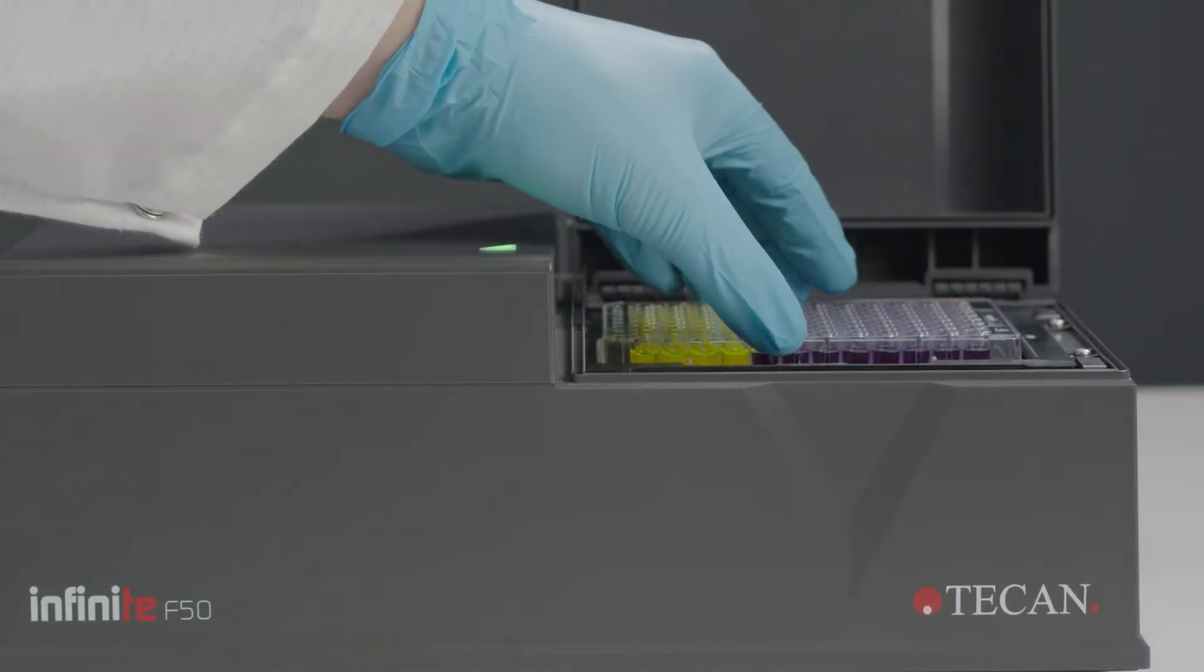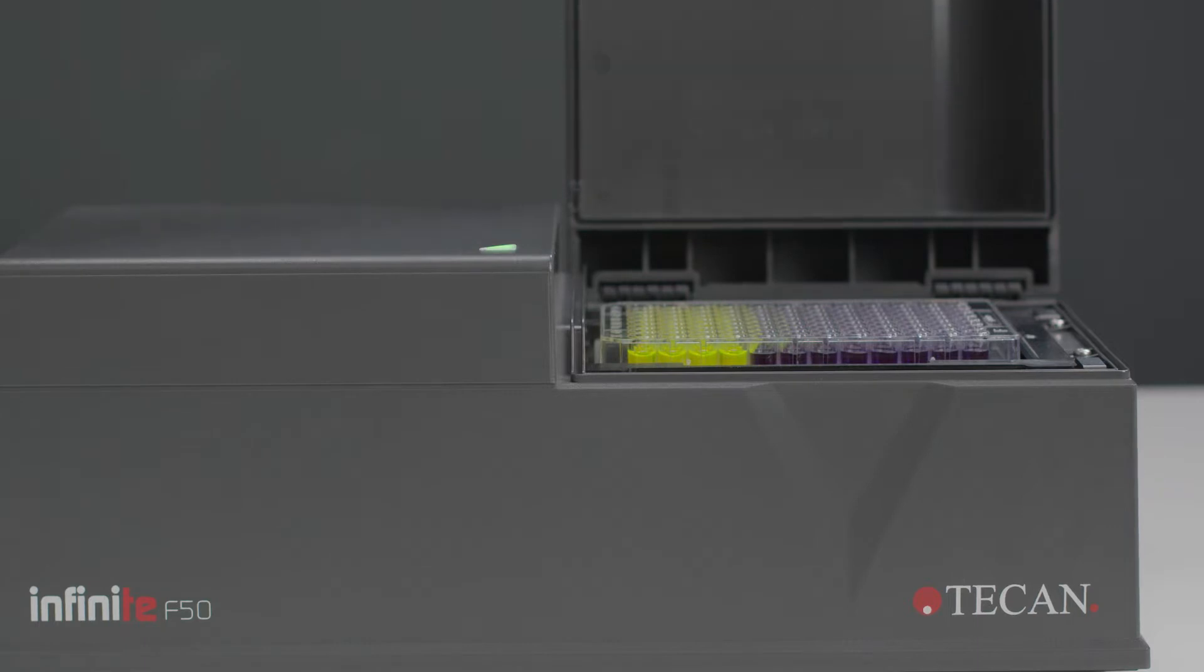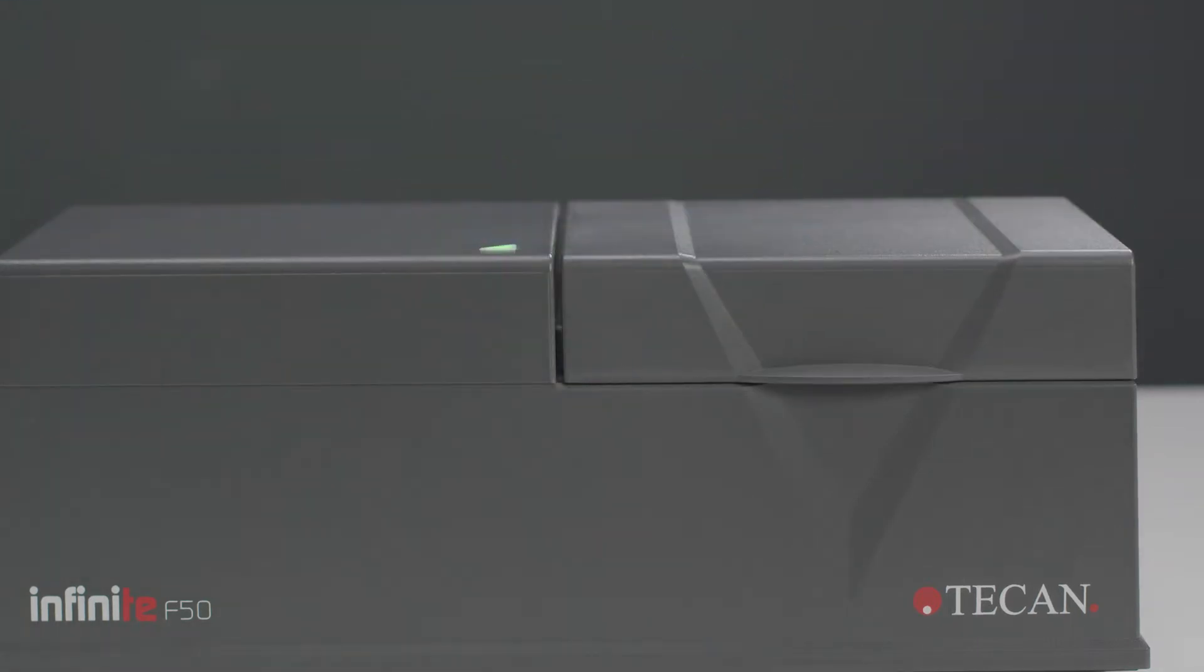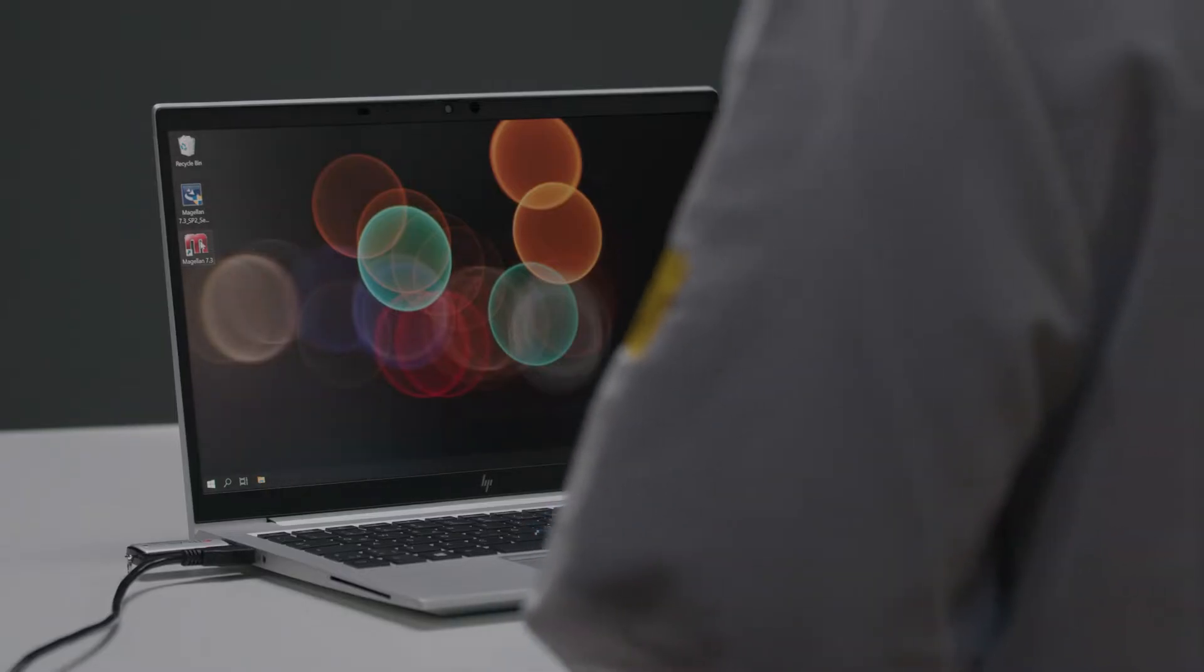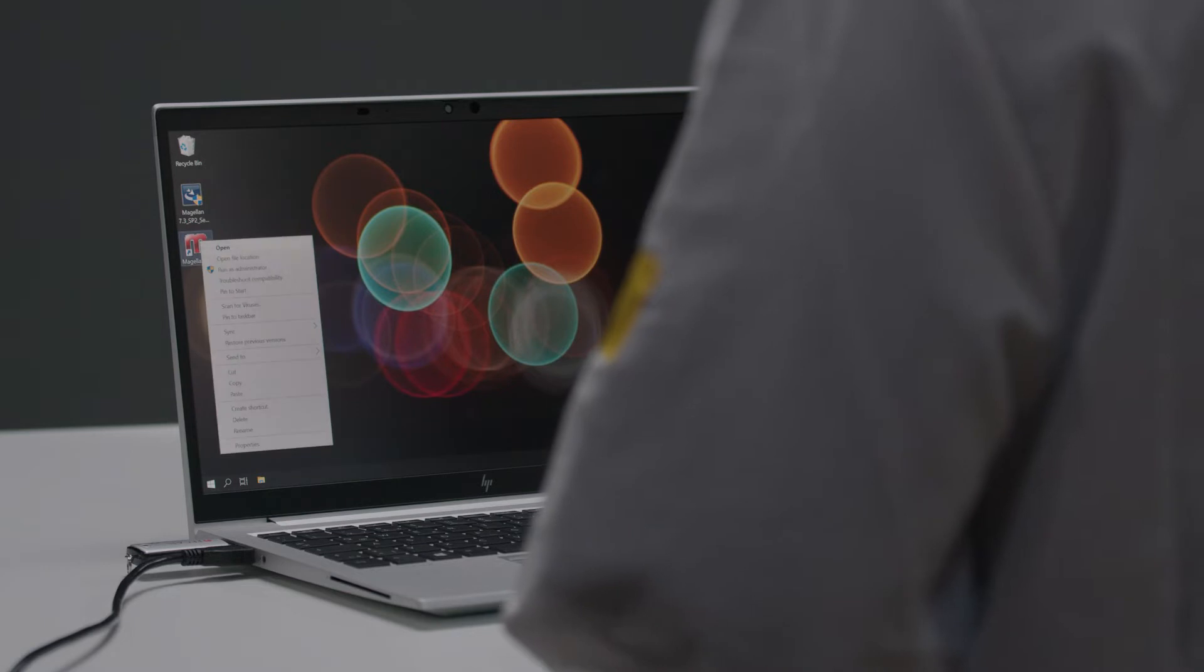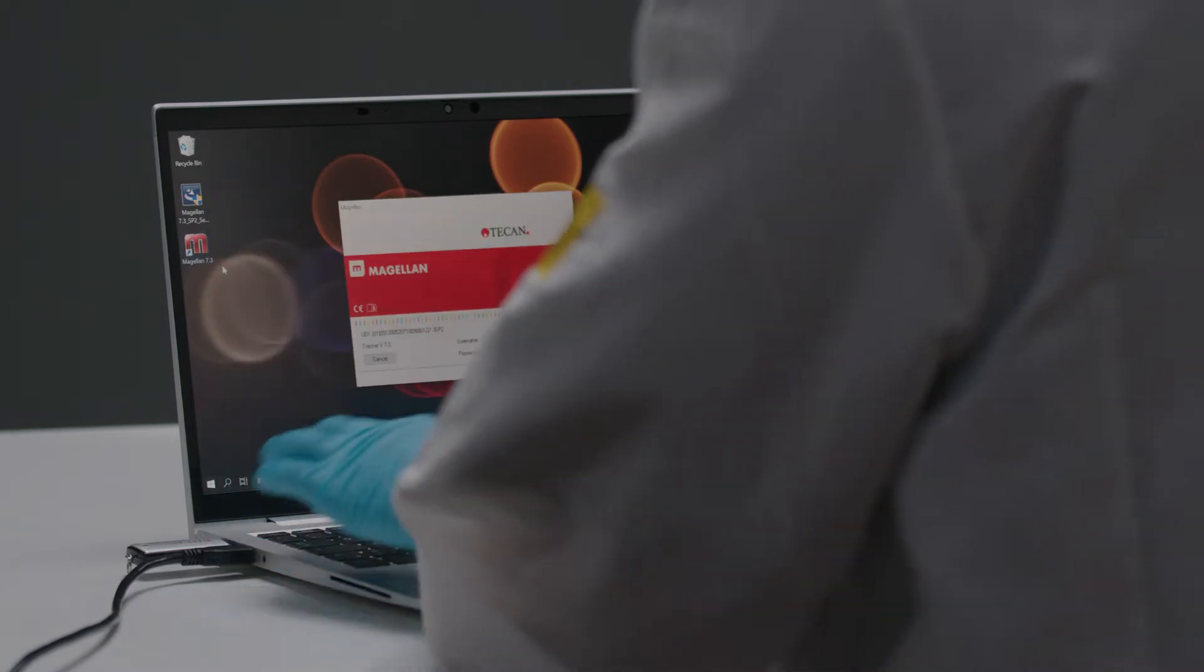The standard version comes with four filters, but you can easily install up to four additional filters. The Magellan software helps you to control your instrument and analyze your data.